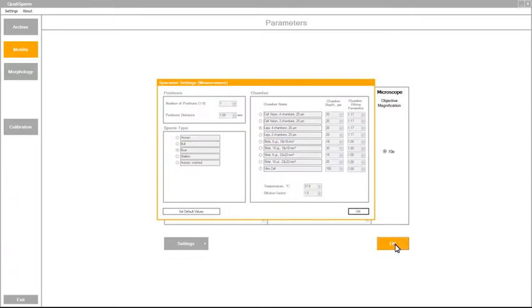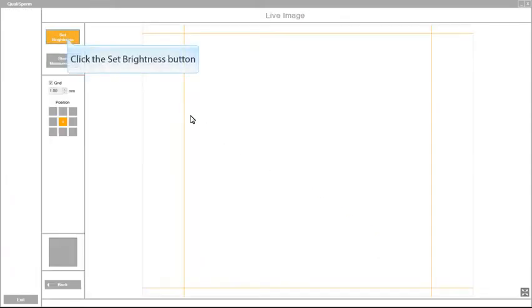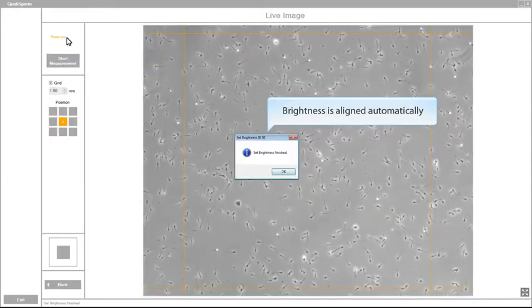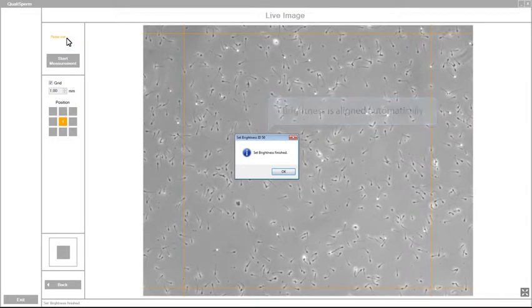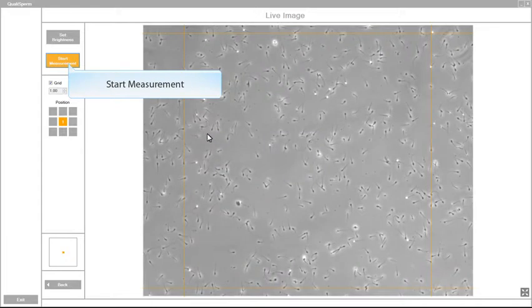All data is automatically stored in Archive so that later you could retrieve previous measurements. After optimal brightness and contrast are automatically set, click Start Measurements.